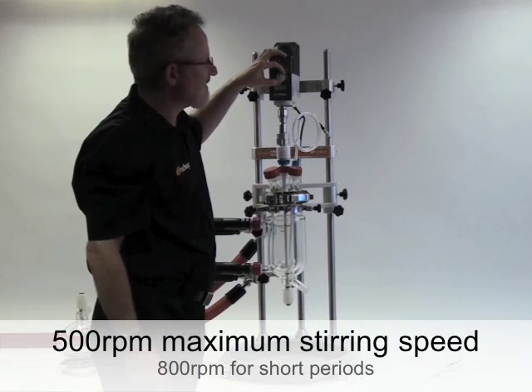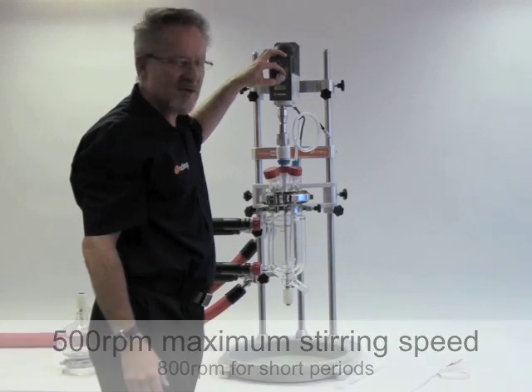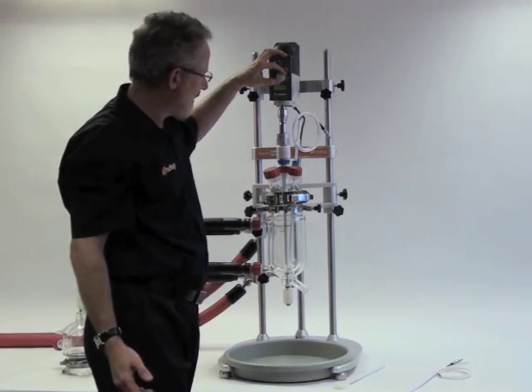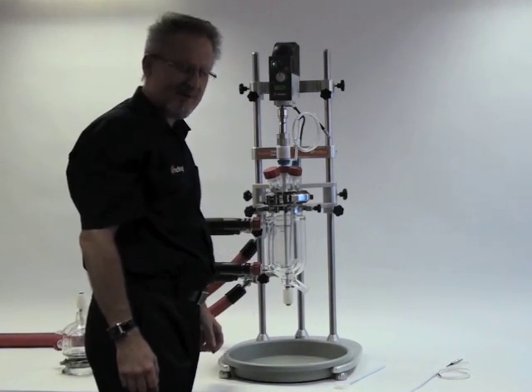I'll take it up to the maximum continuous speed of 500 RPM, but it can be used up to 800 RPM for short periods. You'll see the stirrer shaft is held in position very well by the extension on the stirrer guide.